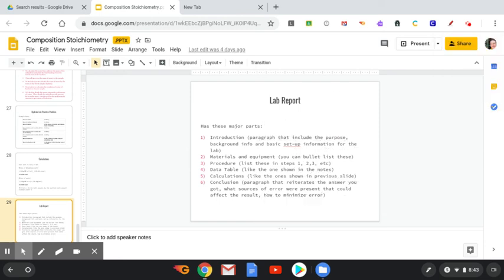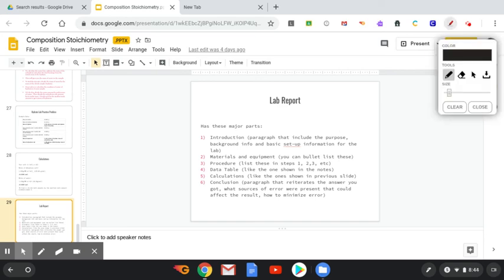All right, so then we go through here. Your introduction should be a paragraph that includes the purpose. This is just one sentence, guys. Your purpose is one sentence. What is the purpose of the experiment? What are you trying to find?